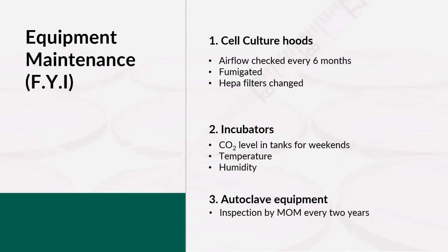You also have preventive maintenance, which is highly encouraged by the manufacturer based on a certain schedule. These include tasks such as lubricating the moving parts, inspecting the electrical connections, and checking some of the safety issues. You also have to do calibration because you have temperature and the pressure gauge to ensure that there are accurate readings during the sterilization cycle.